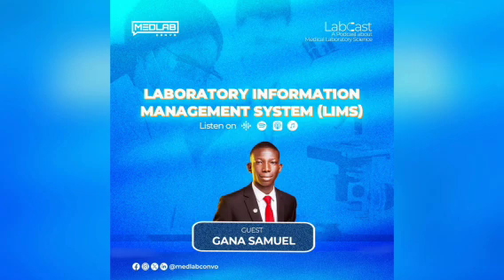Lab-trained IT support or external support only? Lab-trained IT support. Yes. Remember I said whenever there is a change, whenever there is a disruption in the market, opportunities open. Now, one major opportunity that has opened because of LIMS is that we have scientists who can go into software design and software maintenance.